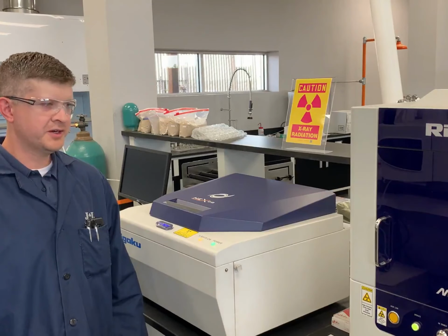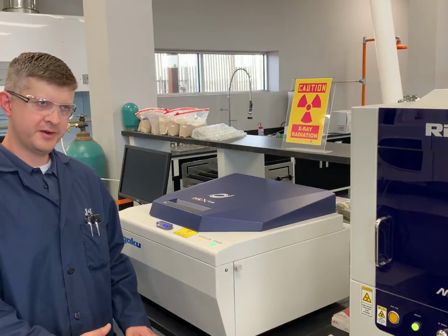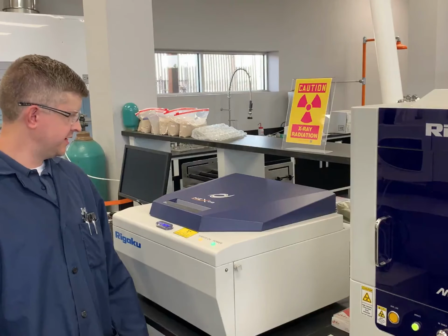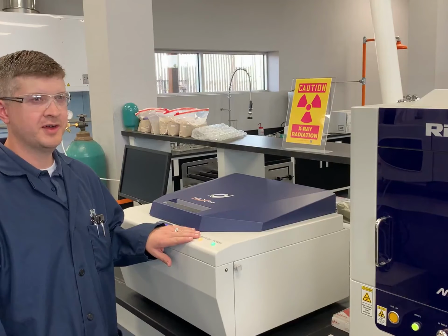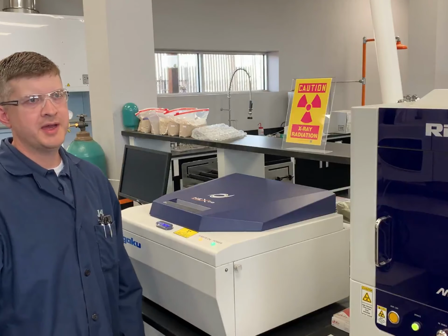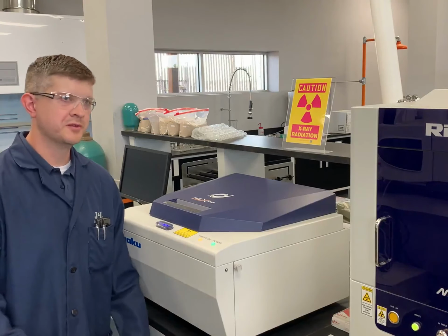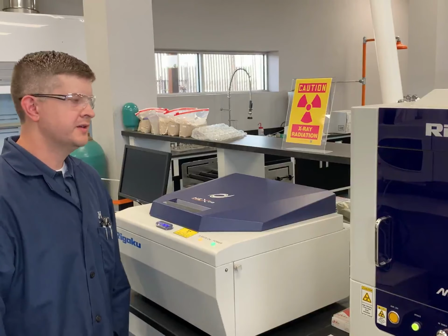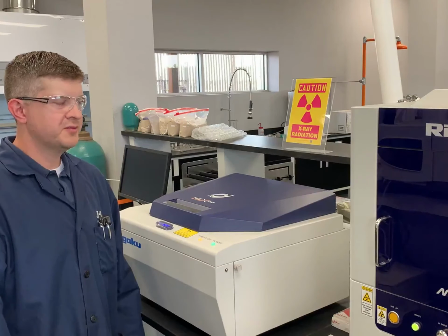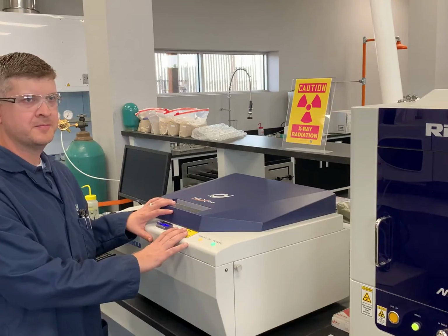Sure. So we're going to use a combination of some wet chemistry along with X-ray technology. The first instrument here that we have is the XRF. This is going to tell us the cations that make up a particular solid. So we'll be able to get our iron, our calcium, sulfur that makes up sulfate. We'll be able to see even the chloride in here. We're going to see barium, strontium. So we'll see the cations here.